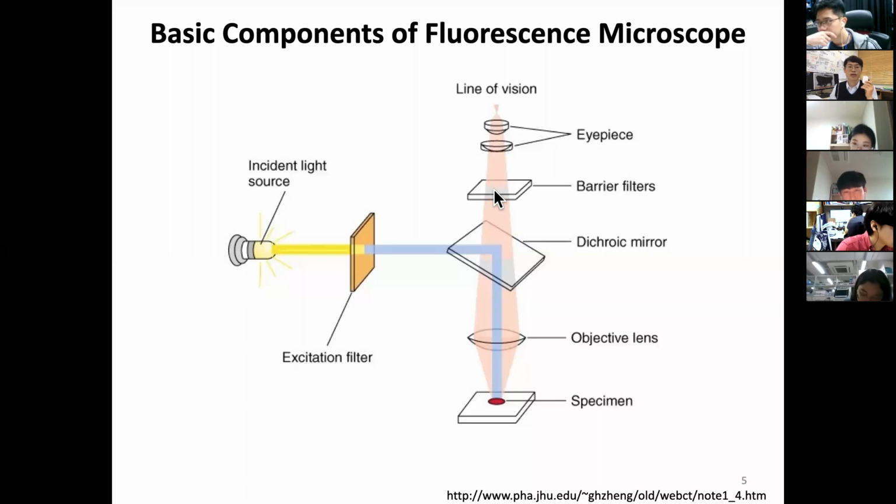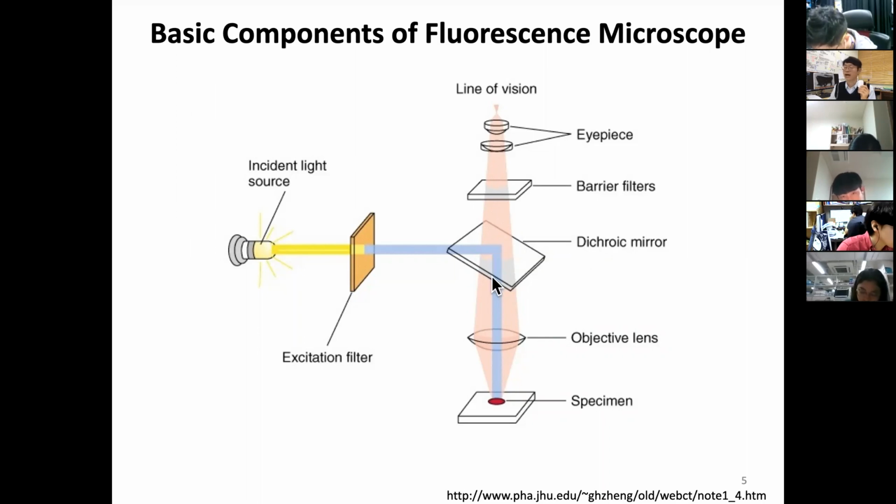So how can we name this? Hey, two different colors will have different behavior. One color will work like a mirror, the other color works like a window. So that's why I name it a dichroic mirror. Di means two, chroic means color, so it functions differently. With the invention of this dichroic mirror, we now can pass this red color.